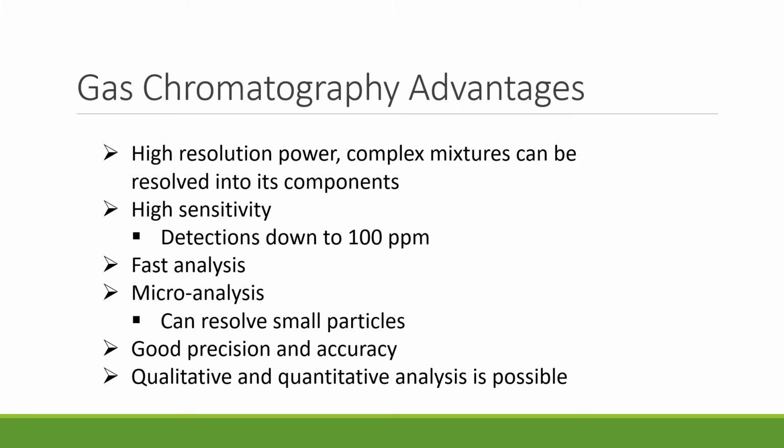So hopefully some of those videos helped out a little bit. But gas chromatography offers a number of important advantages in the analysis of these complex compounds. Some of them are the speed, the ability to operate with a small amount of sample, and great sensitivity. Most of the instruments out there can complete an analysis of substances in less than an hour, and even often in 15 minutes or less.